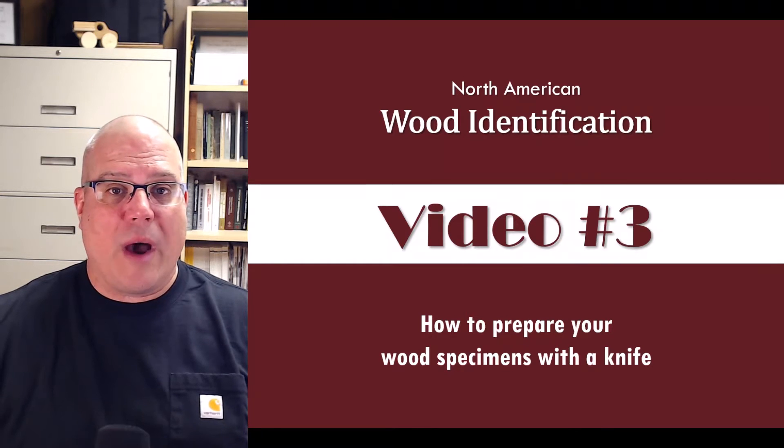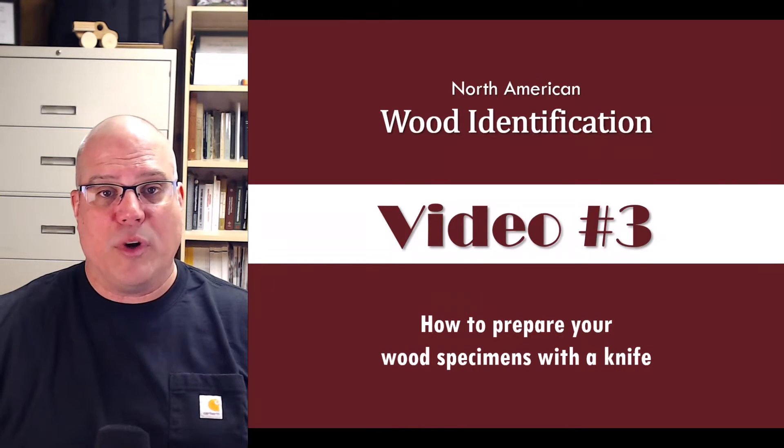Today we're going to show you how to use a utility knife to prepare your wood specimens for examination. Developing good knife skills is vitally important to mastering wood identification, so please spend time practicing until you can make clean cuts.